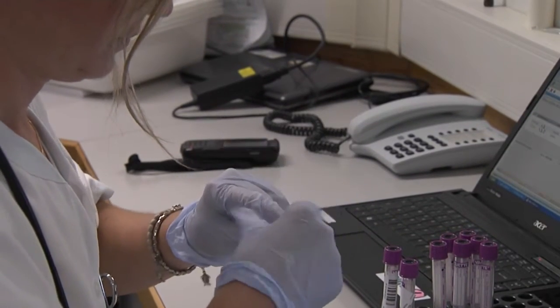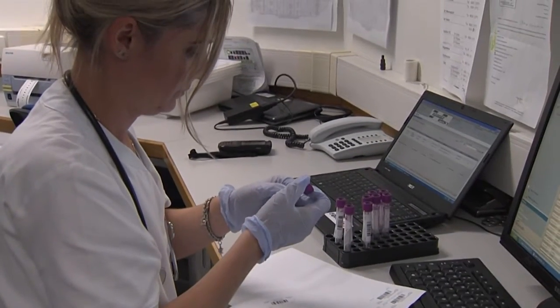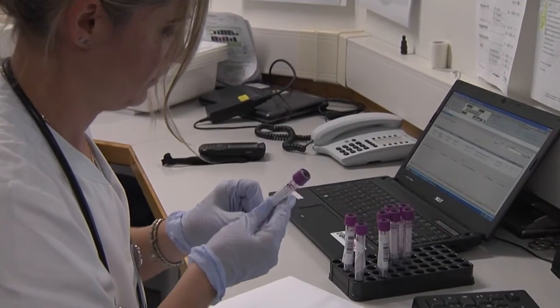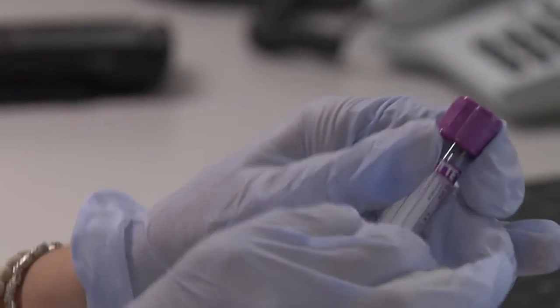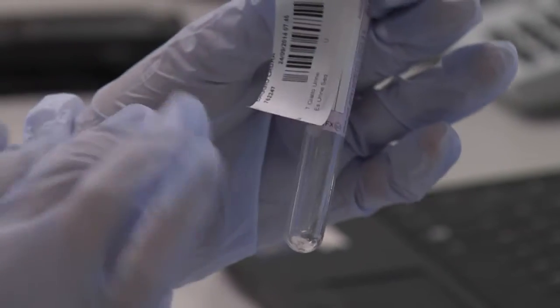Moreover, labeling errors can cause a significant reduction in the efficiency of automated analytical systems, since they lead to a high number of test tubes being rejected by the system, which must be relabeled and submitted again. Manual labeling not only carries the risk of error, but should be regarded as process inefficiency, since it is low-value, repetitive manual work that is carried out by high-value resources.